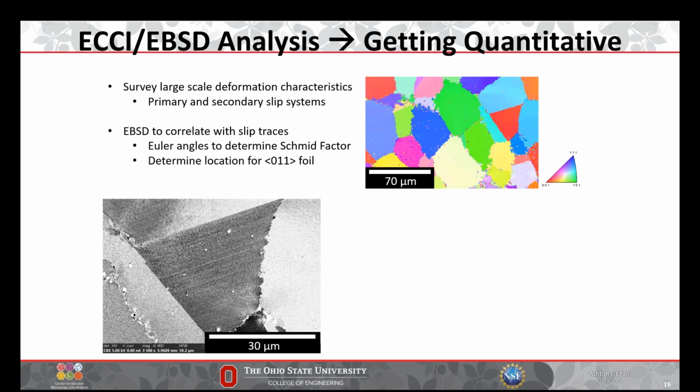Okay. Is it possible to quantify the dislocation density from ECCI analysis? The dislocation density, I'm sure it is, especially if you can see the density, but you also kind of know, at least for these defects, you can get an idea of how many dislocations have passed to give you this many traces, but you would have to make some assumptions there.